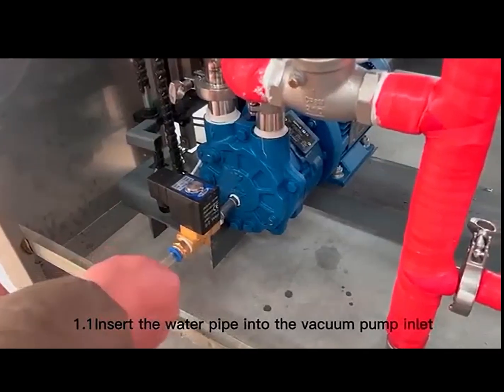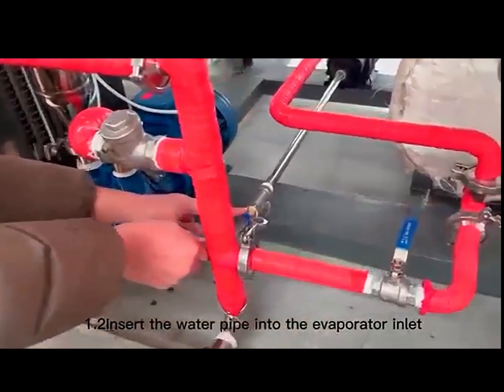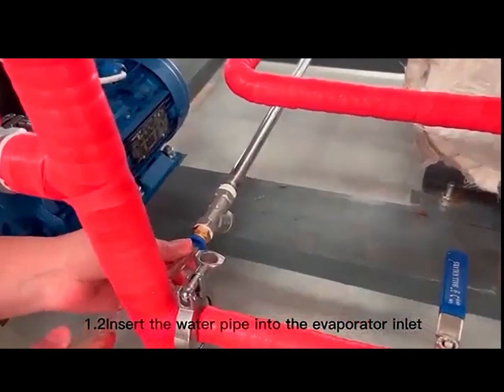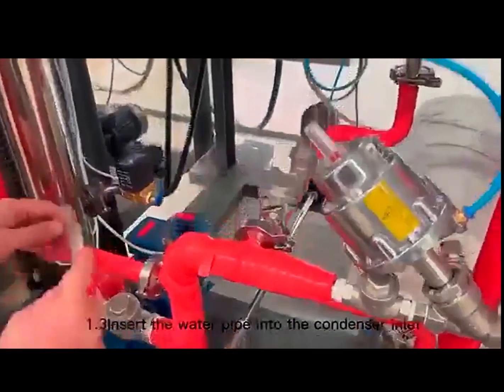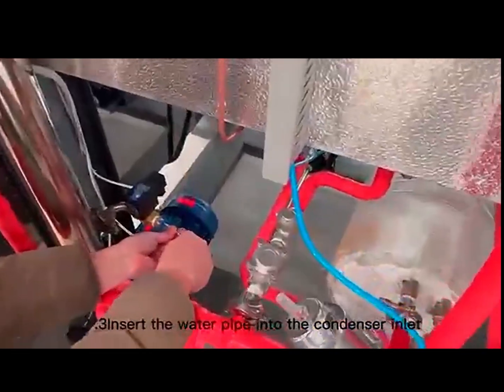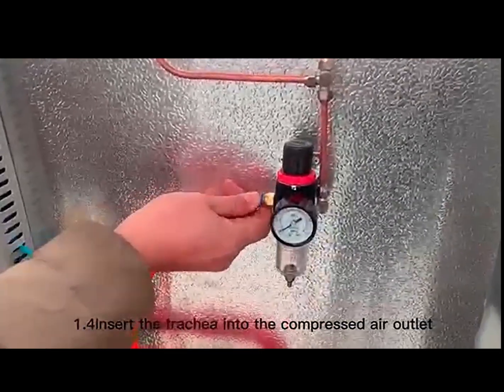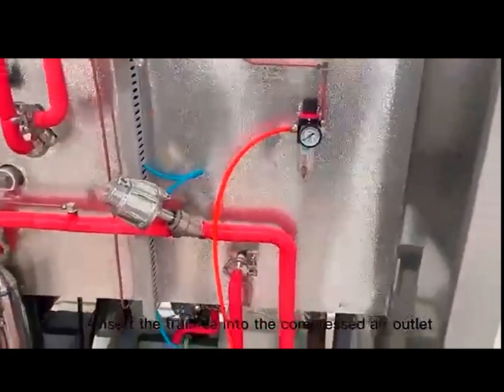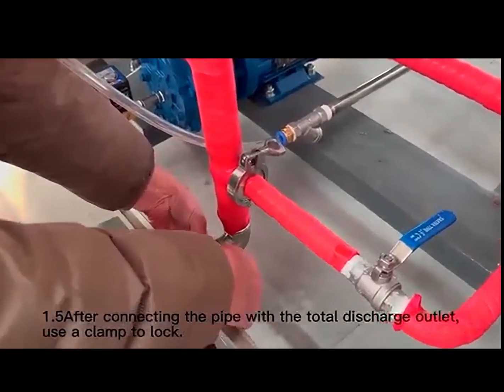Insert the water pipe into the Vacuum Pump Inlet. Insert the water pipe into the Evaporator Inlet. Insert the water pipe into the Condenser Inlet. Insert the trachea into the Compressed Air Outlet. After connecting the pipe with the total Discharge Outlet, use a clamp to lock.